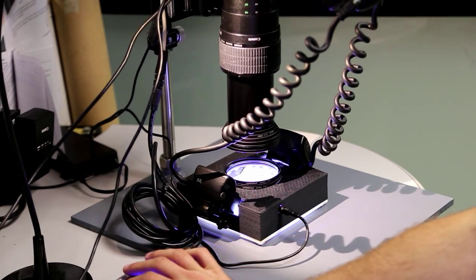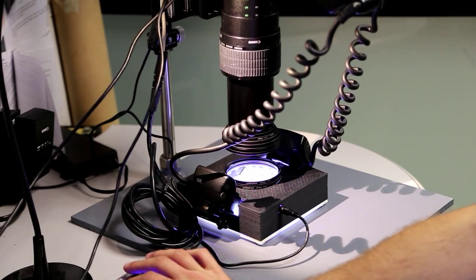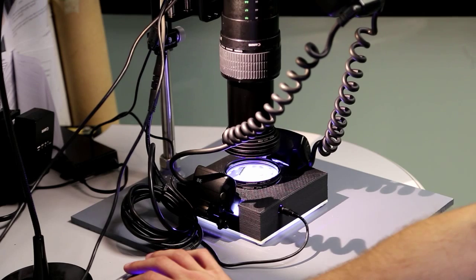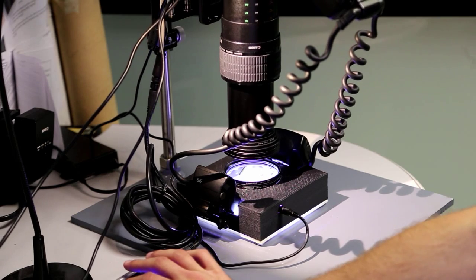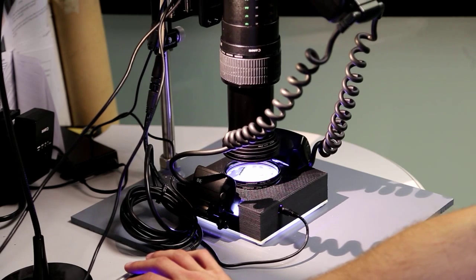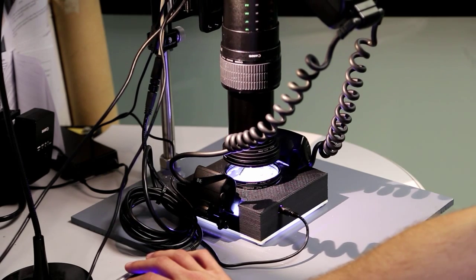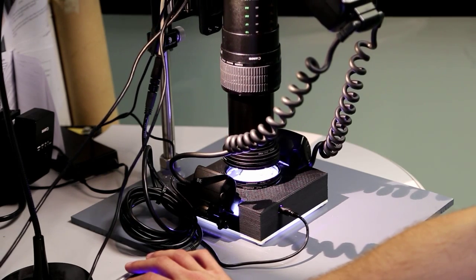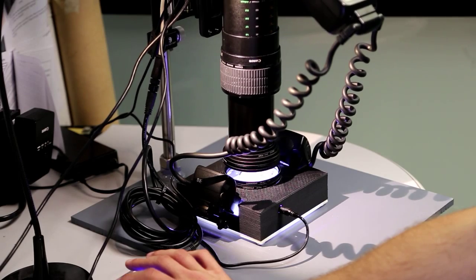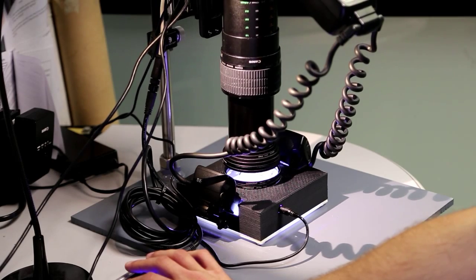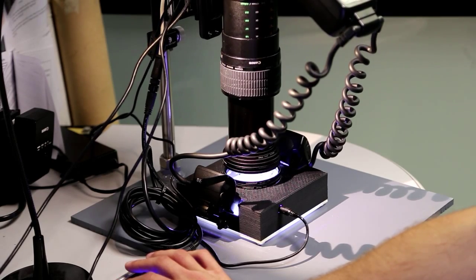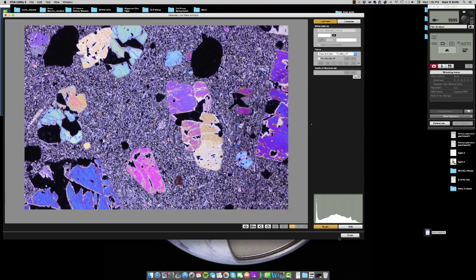When I'm ready to take a picture, what I'll do is I'll move the camera relative to the sample and I'll choose a starting point and an end point so that I can take multiple images through the specimen. In this case, we're going to take 25 individual photographs.